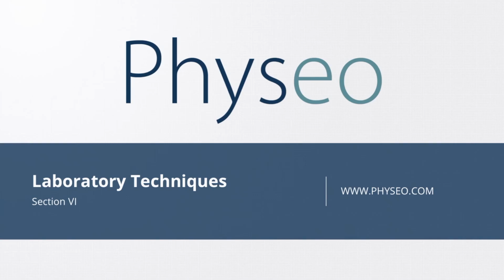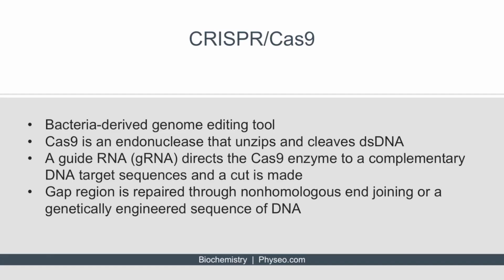Welcome to Section 6 of Lab Techniques. In this section, we'll be discussing CRISPR-Cas9 and molecular cloning. CRISPR stands for Clustered Regularly Interspaced Short Palindromic Repeats. It's kind of a mouthful.